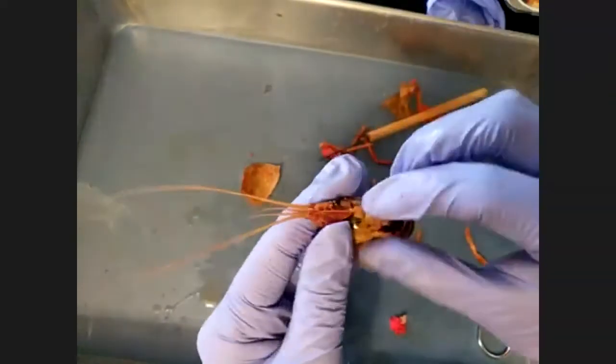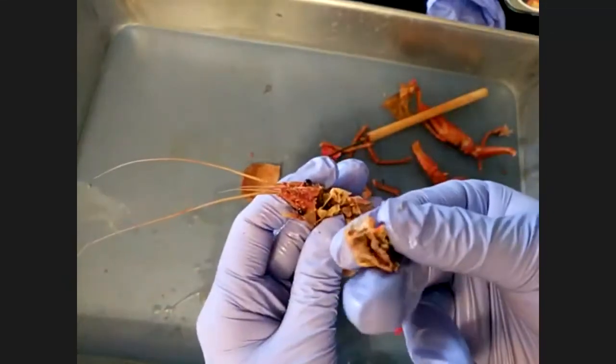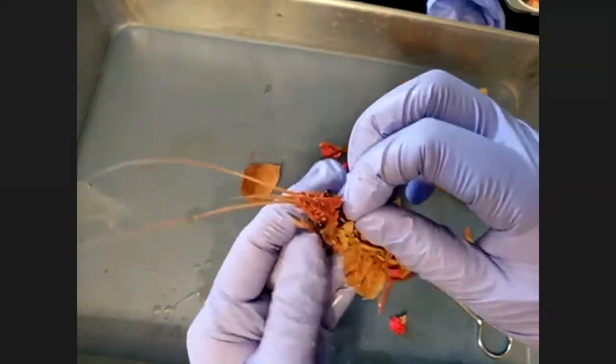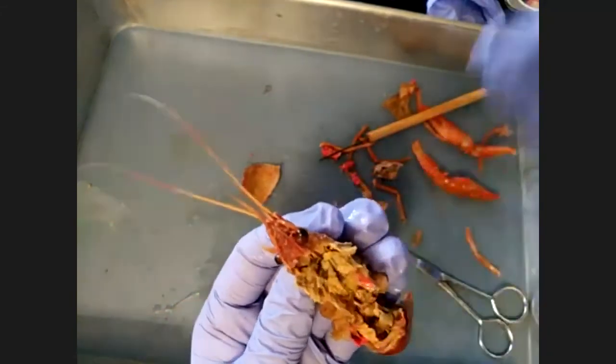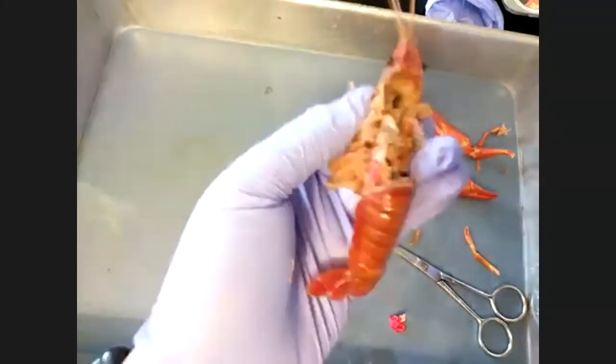So I'm actually gonna remove this. This is one of the stomachs right here. I just ripped it out. We're gonna go see it right now, hopefully. In first hour, I was able to keep it, and I did, yay for me. Okay. All right, right in here, if I can get my phone to focus, I'm gonna move around like this.